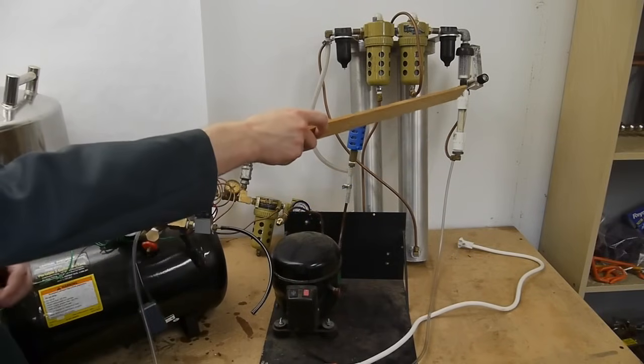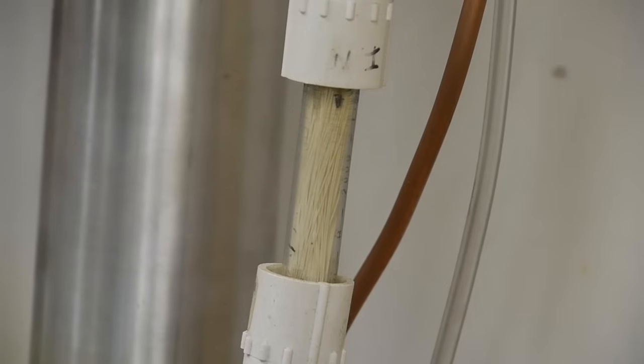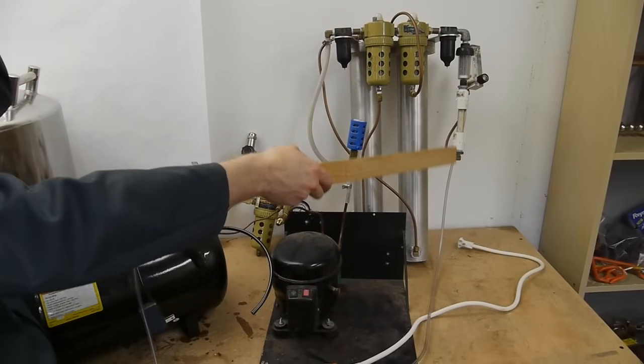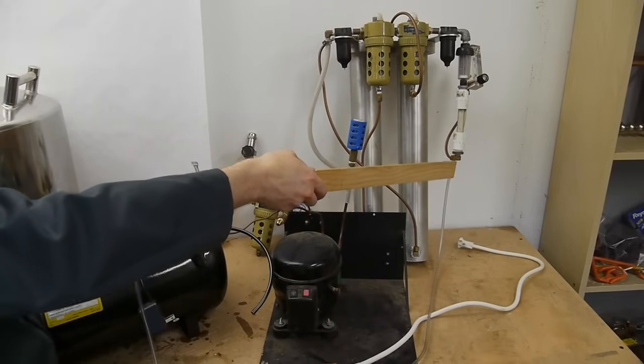The way it works is that 80 percent nitrogen 20 percent oxygen air goes in at high pressure on one side and as the air molecules drift through the tubes the oxygen tends to diffuse through the tube whereas the nitrogen does not. So by the time you get to the other side the gas that's coming out the end of the tubes is nitrogen enriched and the stuff that comes out the side of the tubes is oxygen enriched.